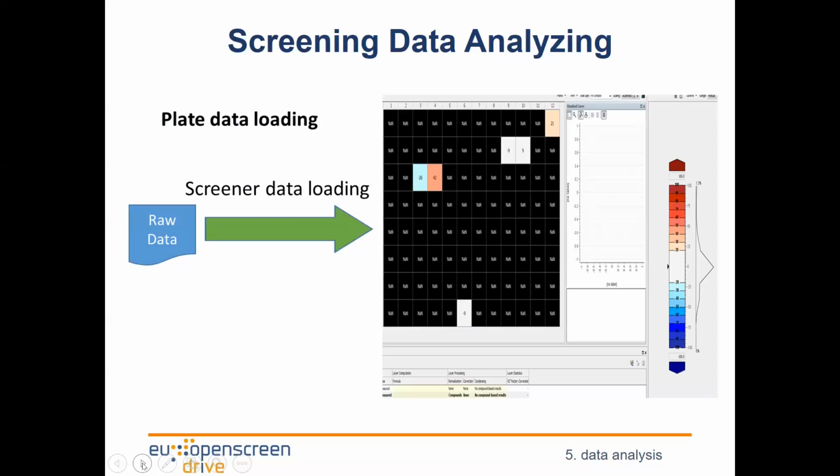And at the same time, like Sheraz presented, this can be transformed into dose response or different dose curves. And doing this in graphs and plots is very important because it gives you, at first view, the hits that you have, the selection of hits, and which of the large number of compounds that you obtained are not important. This is a selection.